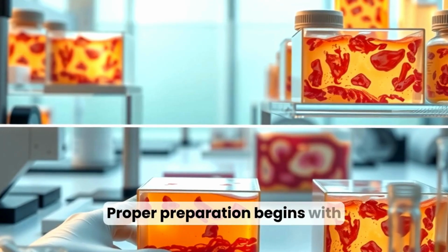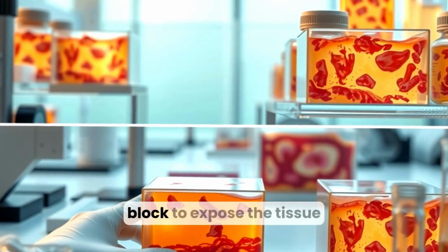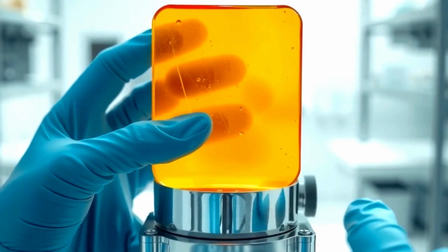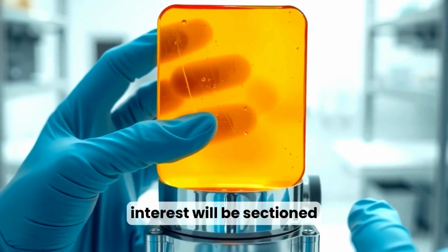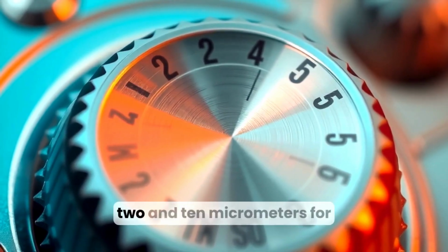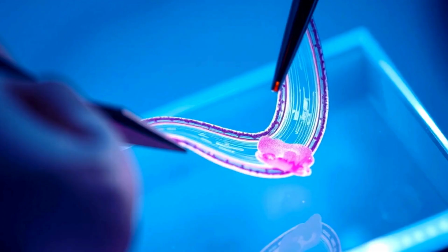Proper preparation begins with fixation, embedding, and trimming the paraffin or resin block to expose the tissue surface evenly. Mount the block securely in the specimen holder and orient the tissue so the area of interest will be sectioned optimally. Set the desired section thickness, typically between 2 and 10 micrometers for light microscopy, depending on the application.